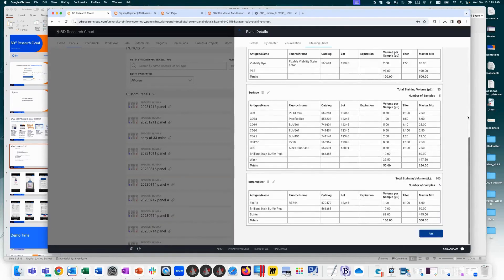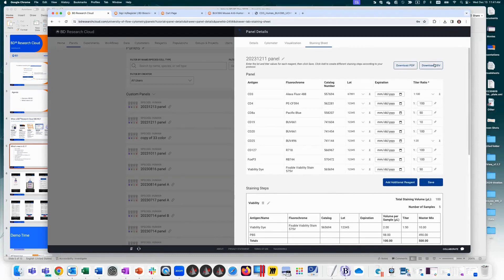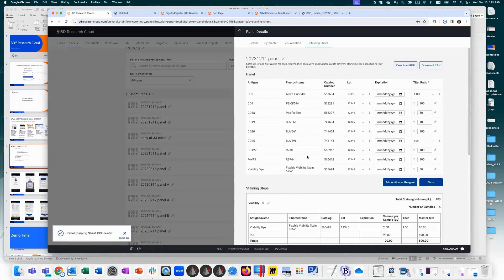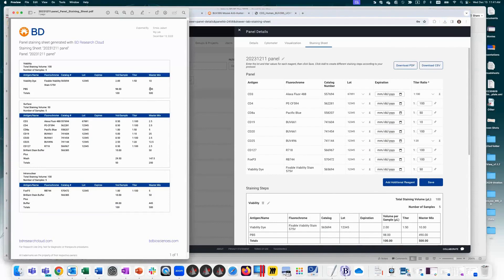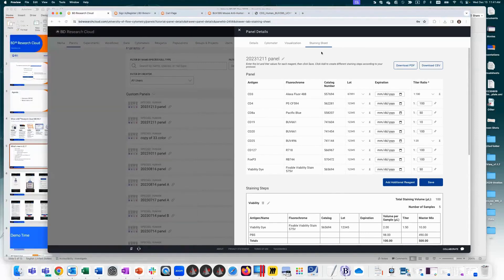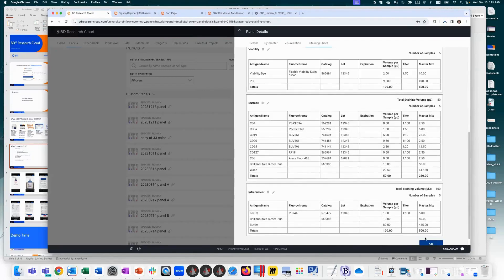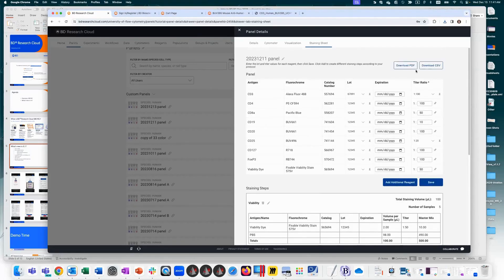Once done, download the PDF or CSV of your staining sheet — a nice summary with the math for what you need to stain that day. You can update the sheet if numbers change; the PDF is the source of truth for what you stained on a given day, and if you change it, that becomes your new record.